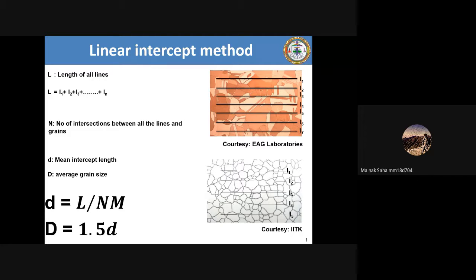Okay, I forgot to mention one thing. Just make a note. Oh, that's why you got such a low value. Okay, I got your answer. The problem is that you divide by the magnification if you don't take the scale, but since you are doing it in ImageJ, we initially set the scale using the scale bar. We already calculated it. Oh, okay. I understand. Like we have already set the scale, so you don't have to divide by the magnification.